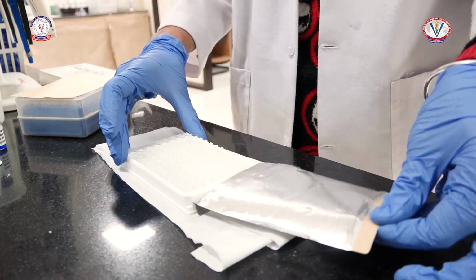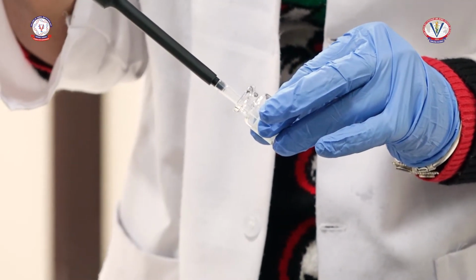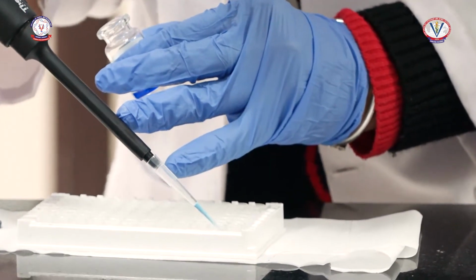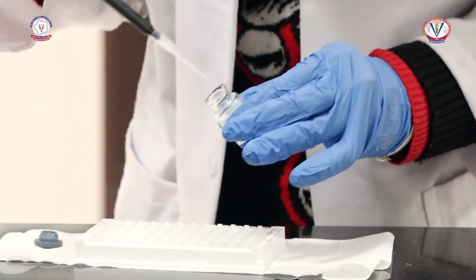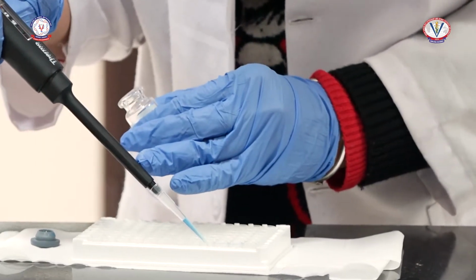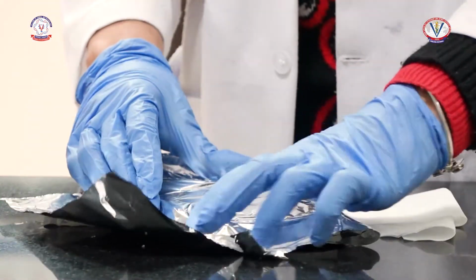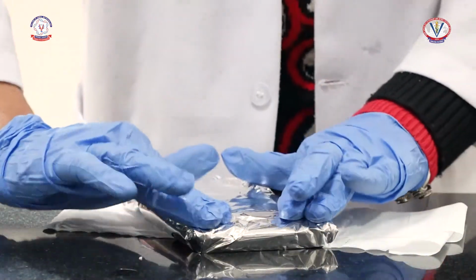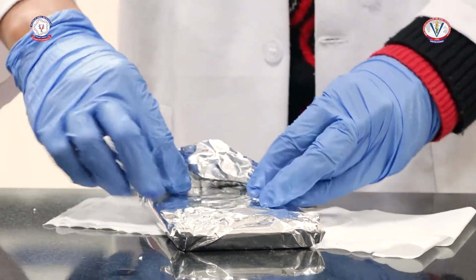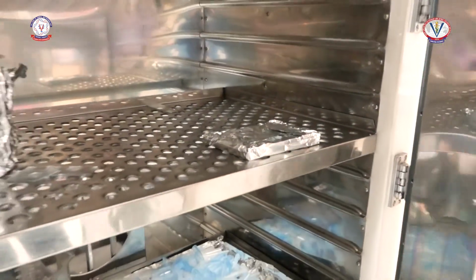After this step, again the plate is washed with washing buffer and then 100 microliter of horseradish peroxidase conjugated secondary antibody is added at the dilution rate of 1:3000 in dilution buffer in each well, followed by incubation again for 1 hour at 37 degrees Celsius.